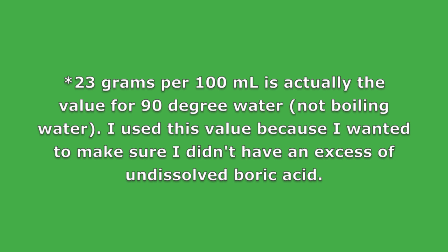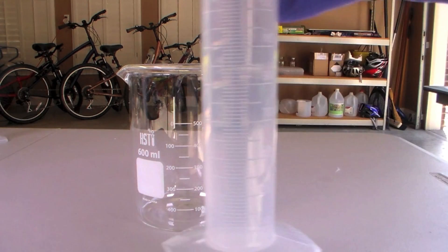The table listed boric acid solubility in boiling water as 23 grams per 100 milliliters of water. Since I want to purify 40 grams, I have measured out 175 milliliters of water and added it to a beaker.